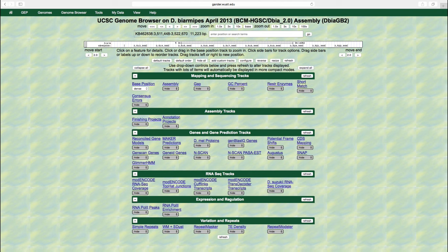Each track has up to five display modes. For example, if we click on the drop-down list for the base position track, the first track under the mapping and sequencing tracks category, we can change the display to one of the three display modes available: hide, dense, or full.